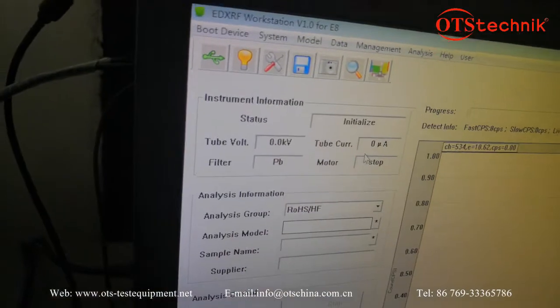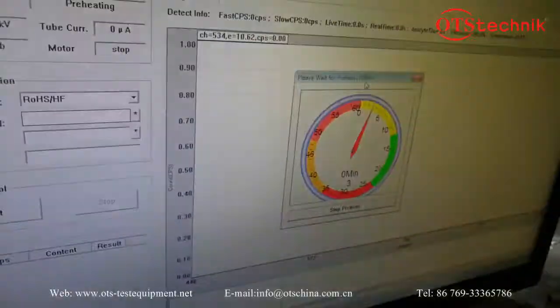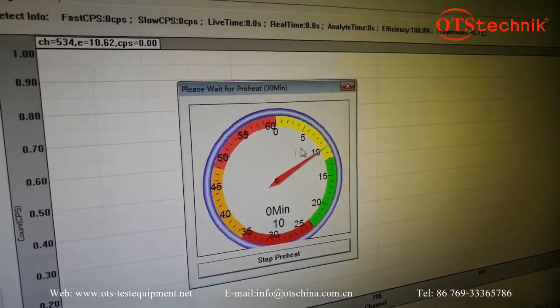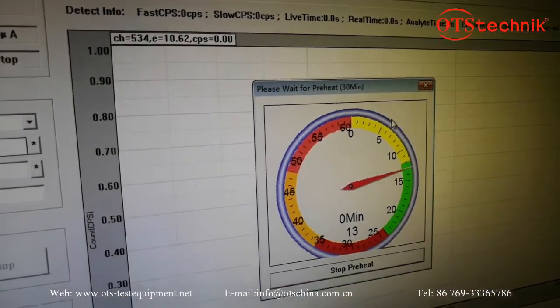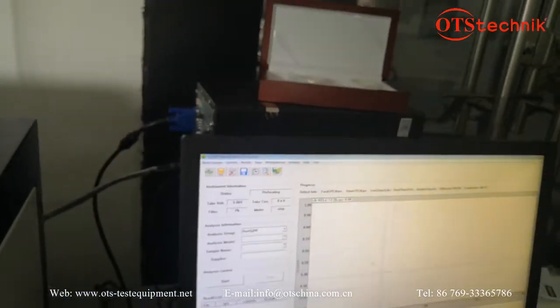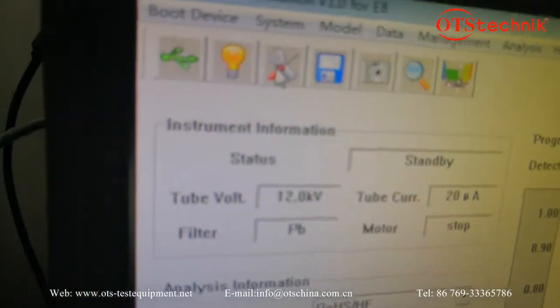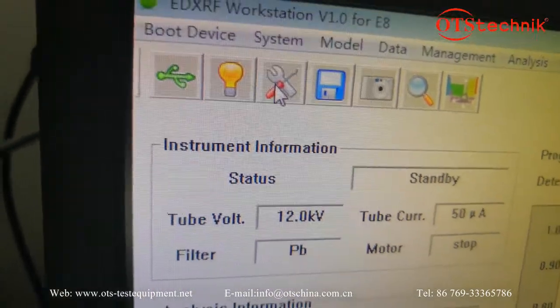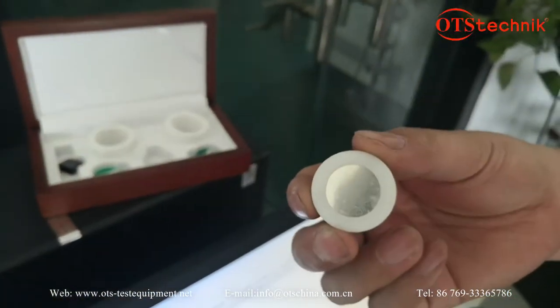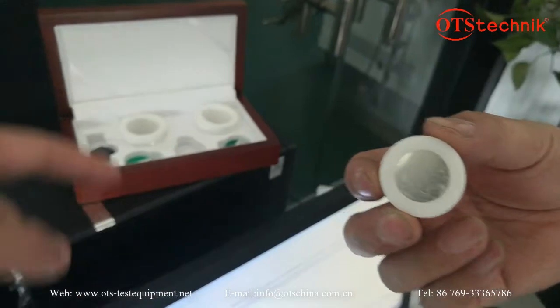The second step, we have to click the preheating button. The third step, we have to do the energy calibration. We have a pure sample for the energy calibration in this box.